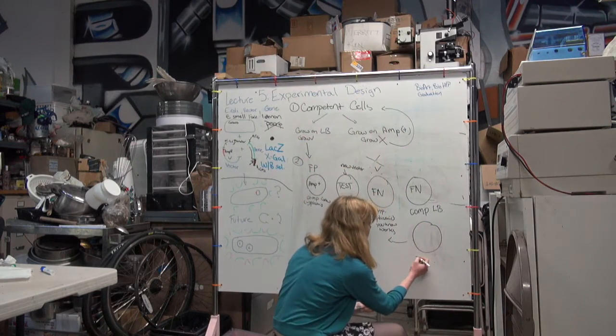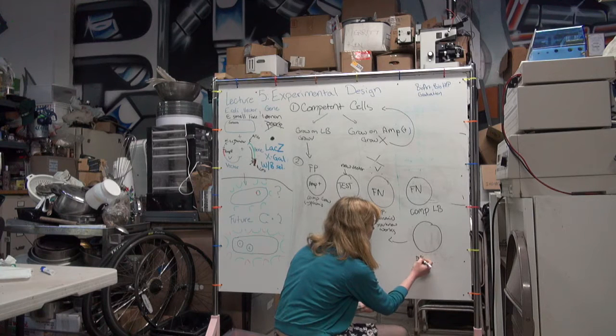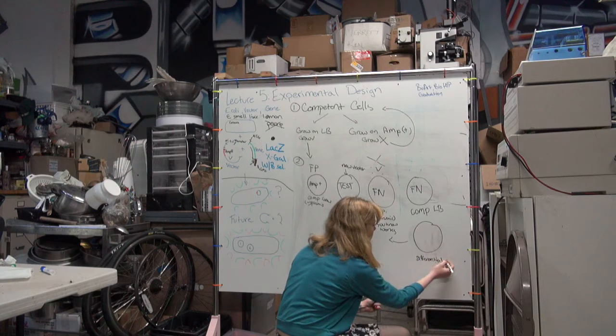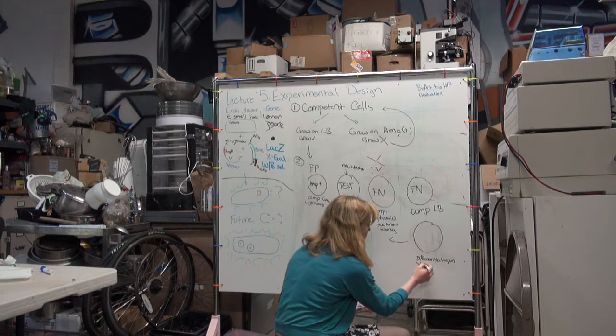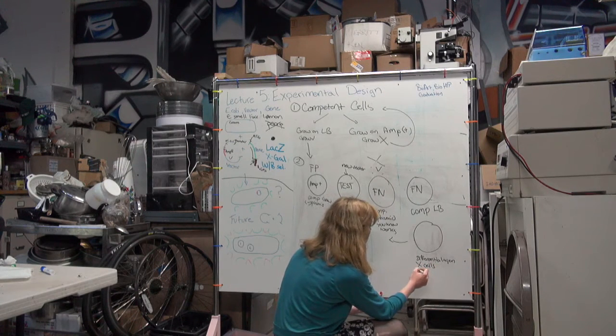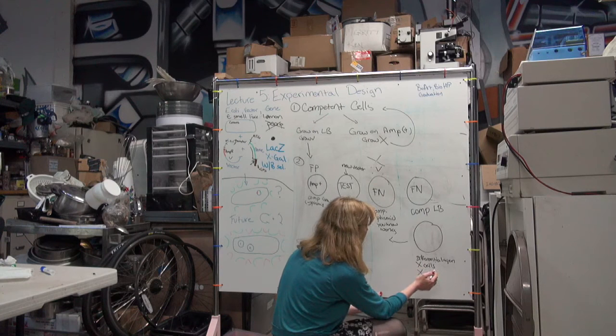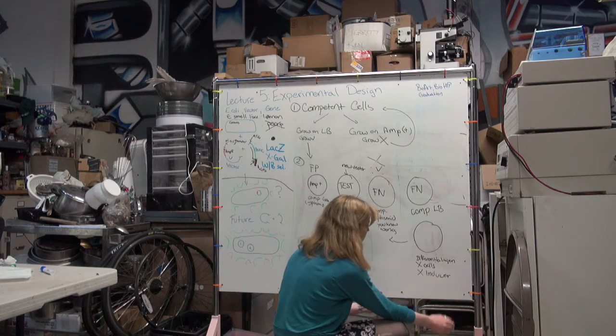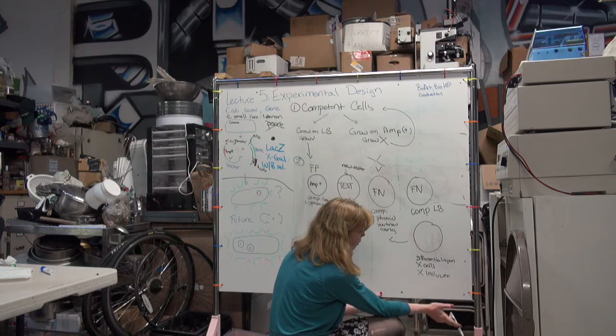Because our differential agent, make sure it doesn't kill our cells. And also, you want to make sure that if you have an inducer in the plate, that the inducer is working right.